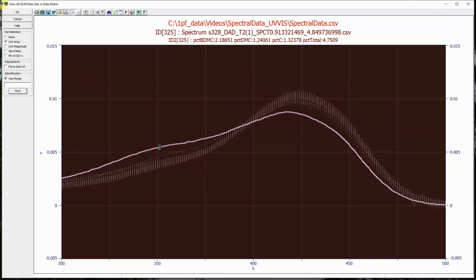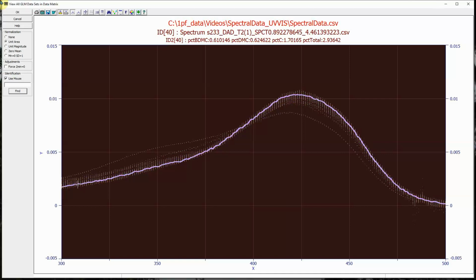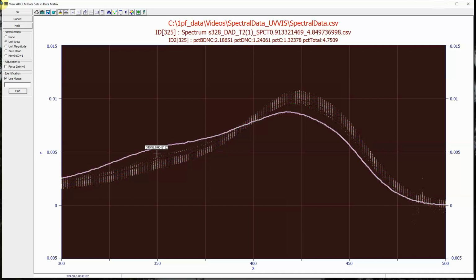You see here we're looking at 3 replicates of this particular sample, which very much stands apart and does represent what we call the bracketing in a multivariate modeling problem. And you can see as we look at this zone right here, we have no data actually represented in these portions of the overall unit area normalized spectra. When you see something like this, it's often of value to just do a blend of that particular material and this to produce some spectra that will cover the bracketed range entirely.